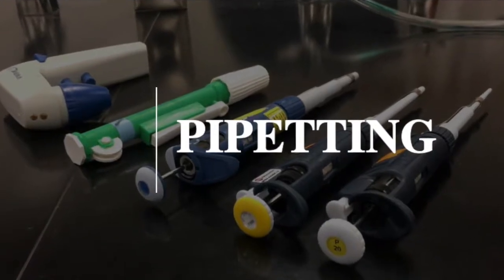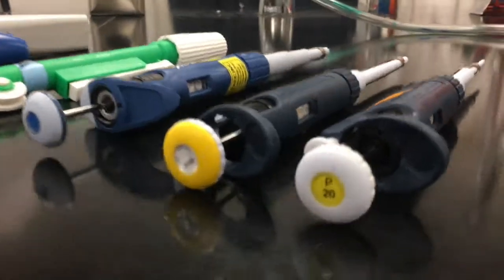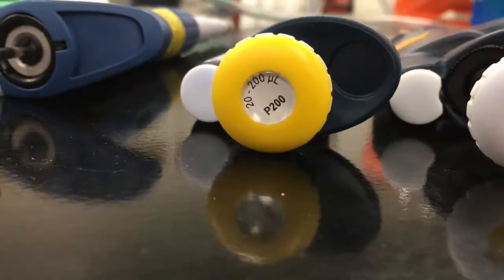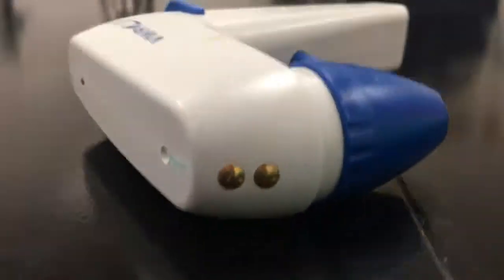This video will demonstrate proper pipetting techniques. We will look at using micropipettes such as the P20, 200, and 1000, as well as serological pipettes both manual and the electronic version.